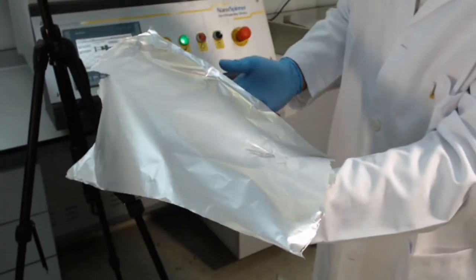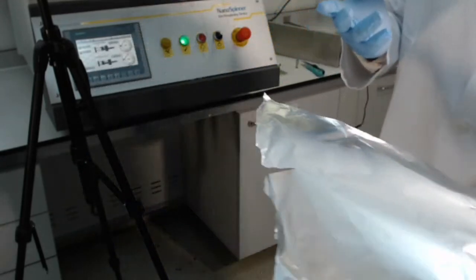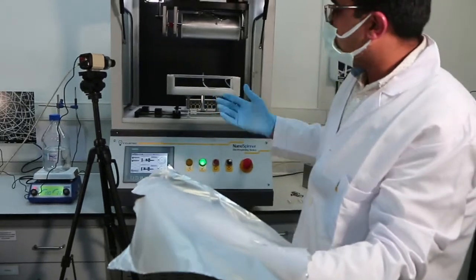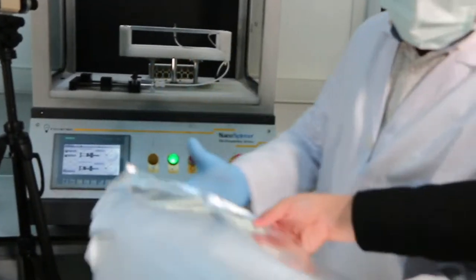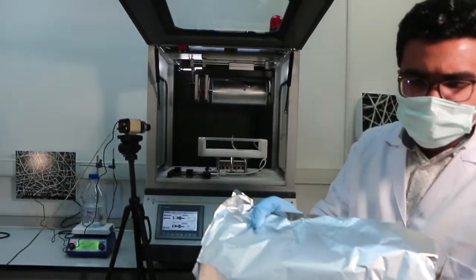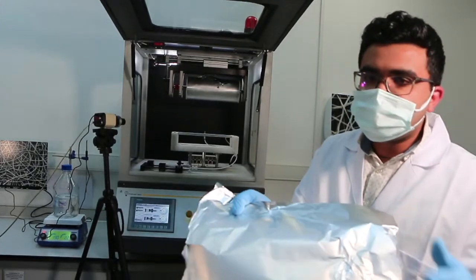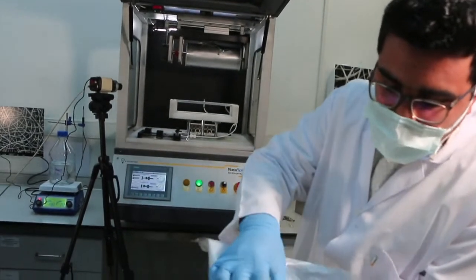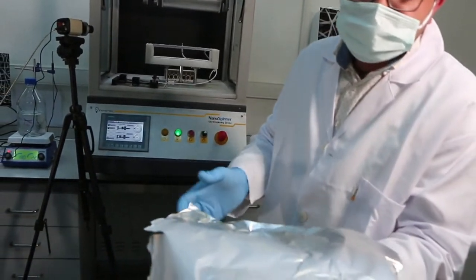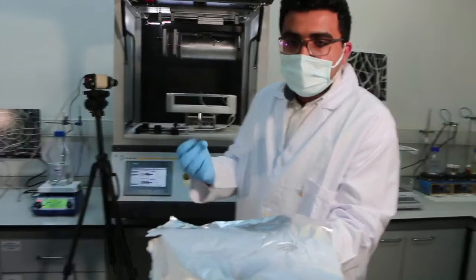Now, in our past experience with nanofibers, you would like to have post-treatment, or rather, you would like to have nanoparticles incorporated. So what we do is we fill the solution with nanoparticles, like silver particles, to incorporate an antimicrobial layer, or you would want to use a VOC compound, VOC anti agents, so that you can incorporate an odor adsorbent.